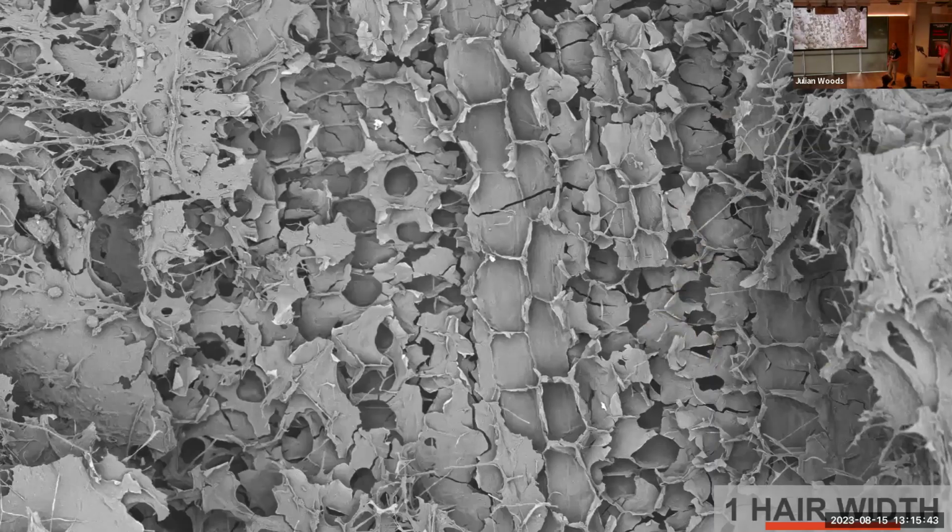So upon looking closer at the grass mat sample, we can see the cellular structure of the actual grass that makes up the mat. And so you can imagine if we had mats that were made of different materials, this cellular structure might look different, and we could better inform our knowledge of what materials we use to construct these mats, which might differ from place to place around the Pacific.